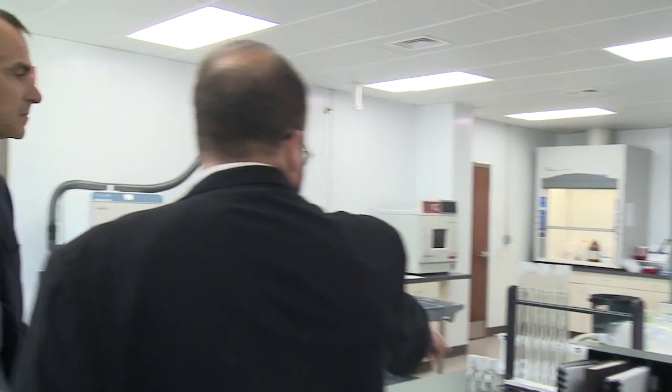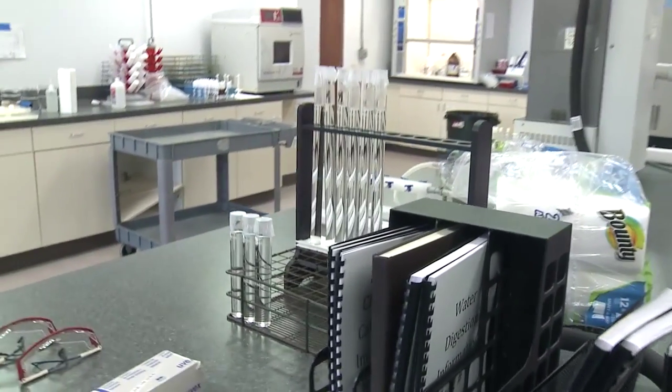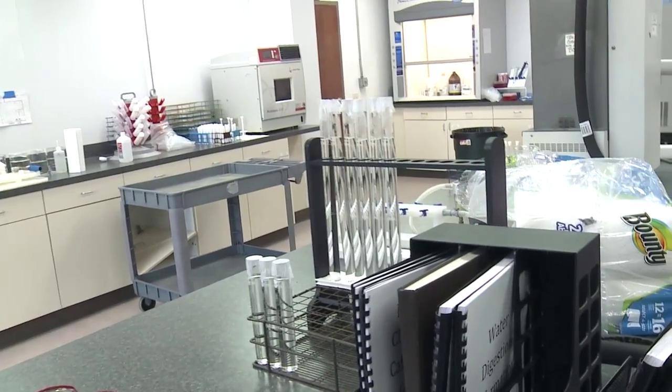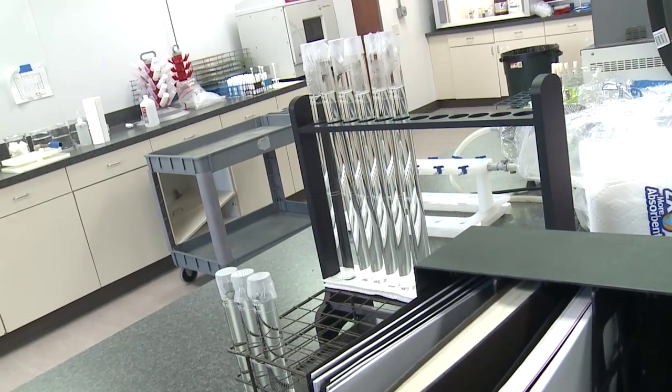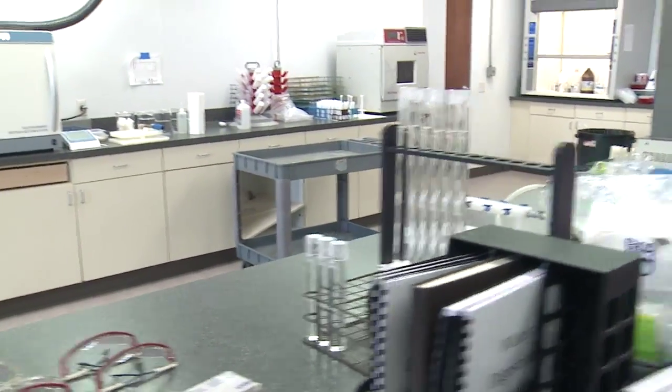Is that what these are? Have they been reduced? That is a different method. A customer in Maryland just sent us their equipment. This is an old U.S. Pharmacopoeia method. They want us to transfer their old method of doing things to the new method that the USP is prescribing. So we've taken all of their materials and are doing it in their old method so we can validate the new method to show that the results are equivalent.